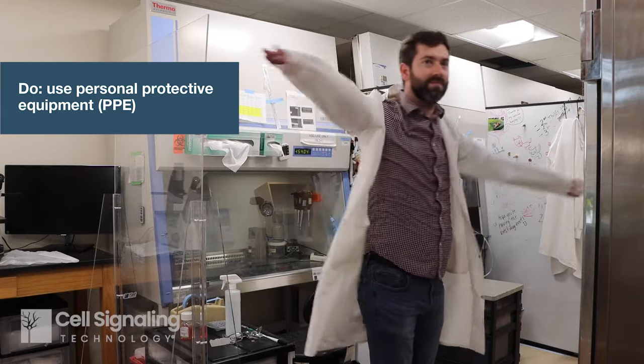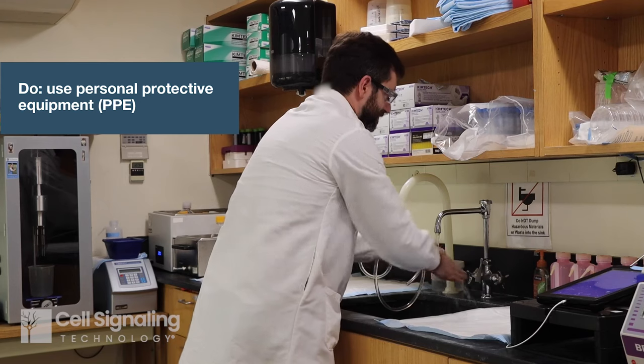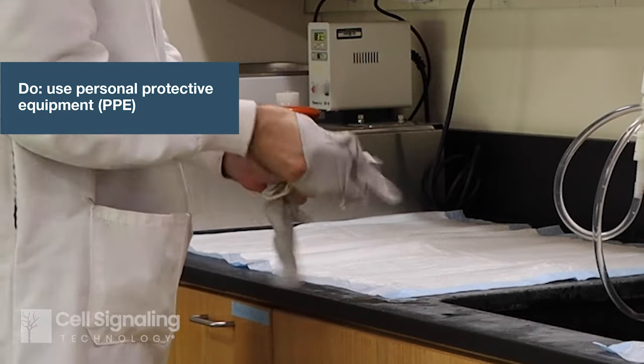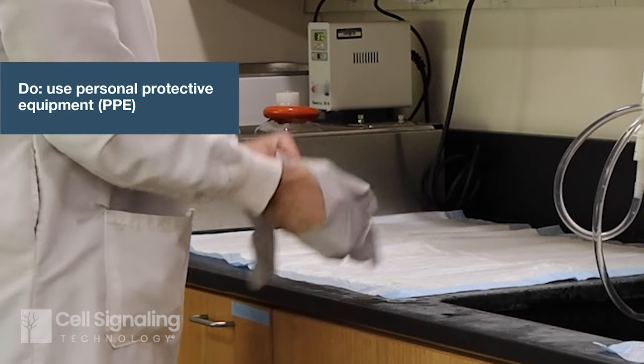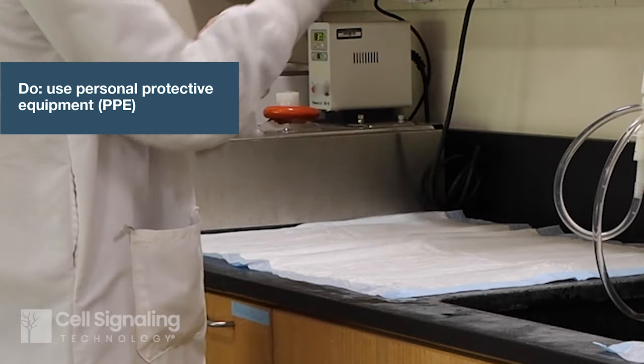Before starting, wash your hands and put on PPE including lab coat, long sleeves, gloves, and safety glasses. These reduce risk of contamination and offer protection. Always adhere to biosafety guidance from your local lab safety officer, depending on the materials you will be working with, including disposal of waste.